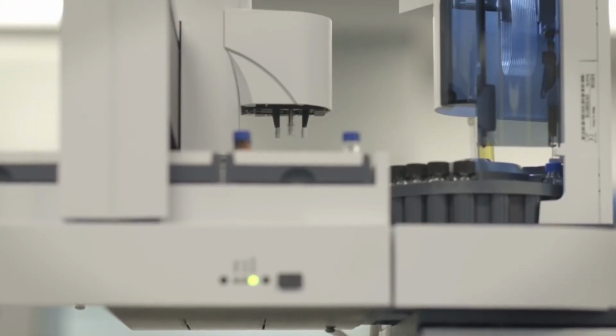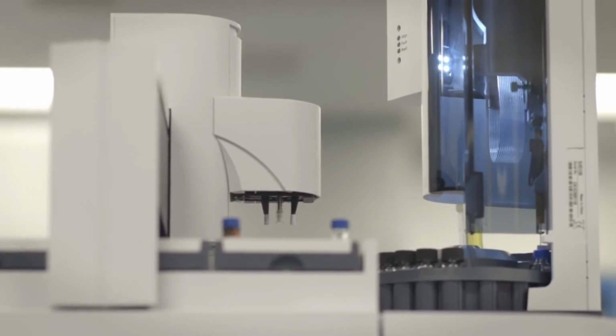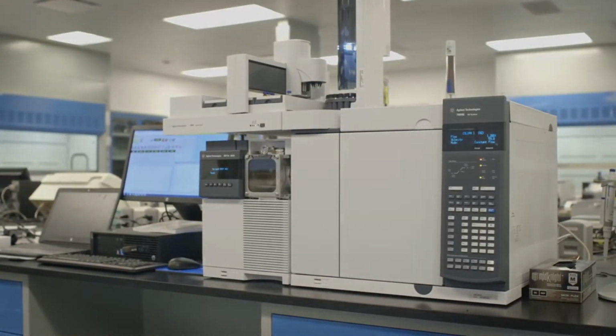And the molecules are then fragmented with electricity. Those fragments are measured by mass. Each molecule is specific and it fragments specifically, and so the detector can tell what mass, and from there tell us the molecule.